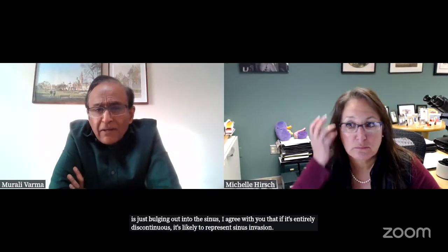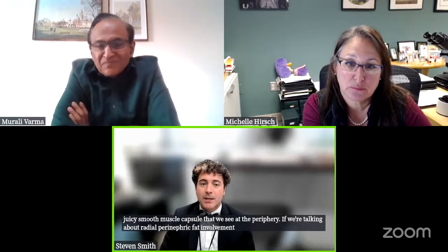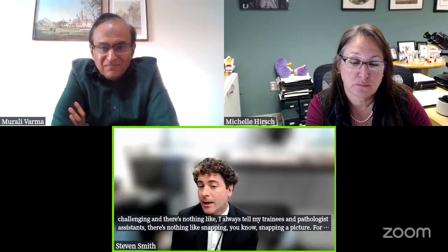Yeah, the fundamental challenge is that the interface between the renal parenchyma and sinus fat doesn't have that nice, juicy, smooth muscle capsule that we see at the periphery. If we're talking about radial perinephric fat involvement, that makes it challenging. I always tell my trainees and pathologist assistants, there's nothing like snapping a picture. For us, this is annotated online, and you can even put cassette B from area indicated on photos, if I'm not there at the time of the prosection.